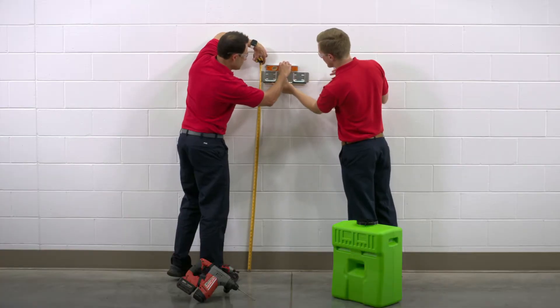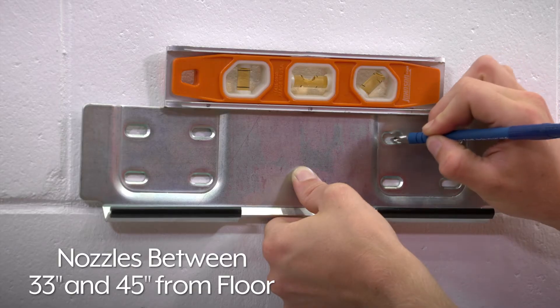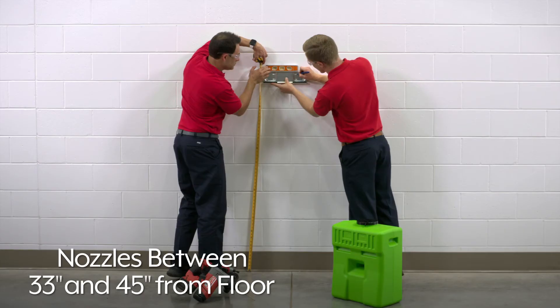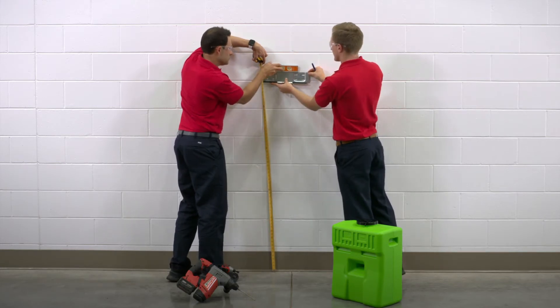To begin, measure, level, and mark the height, ensuring the nozzles are between 33 inches and 45 inches from the floor, and the area below and immediately surrounding the unit remains clear.